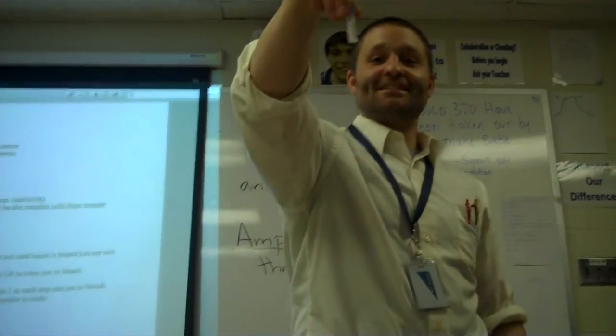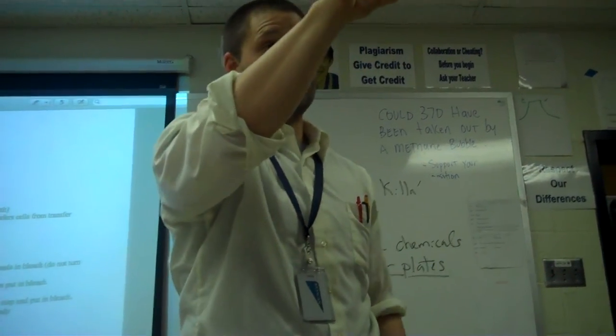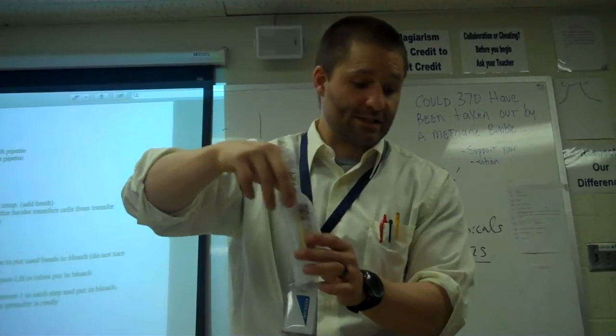Now, this is the recombinant DNA in here. There's a lot of them. This is why this lab is expensive, because of this plasmid here. This is the plasmid that has the 2 genes that we need right here. Other stuff you don't care about. This is the cool stuff.